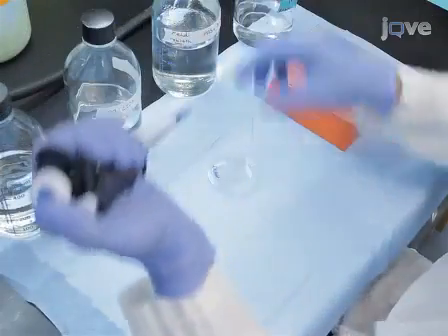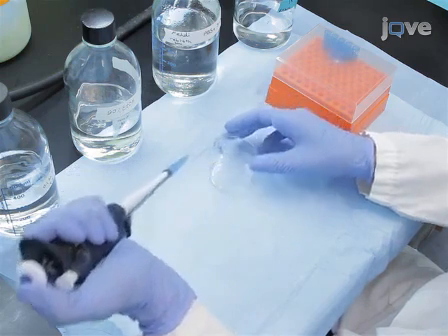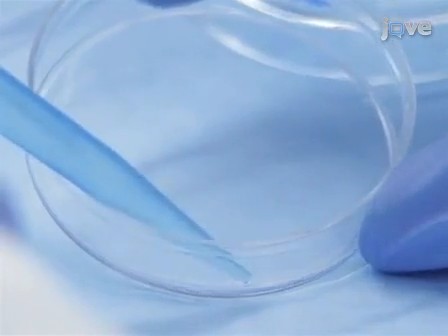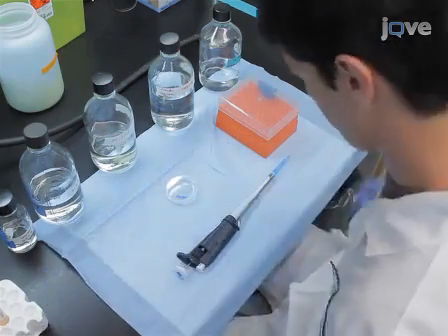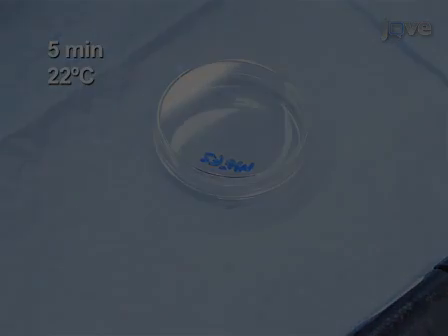This time using PBS supplemented with 3 millimolar EDTA, rinse the cultures quickly once more and then aspirate the PBS EDTA solution thoroughly. To detach the cells, add around 0.5 milliliters of PBS EDTA to each 6 cm culture dish and incubate the dishes at 22 degrees Celsius.